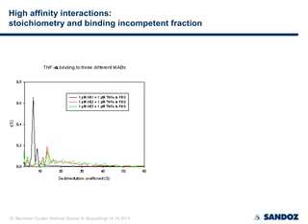And what you can also do is, after you check your target, for example, here in this case TNF-alpha is binding competent, you may add an excess of your target protein and check whether your protein formulation contains any non-binding, incompetent fraction.